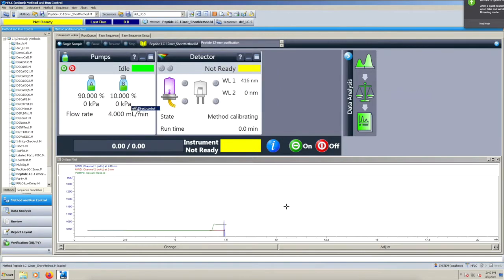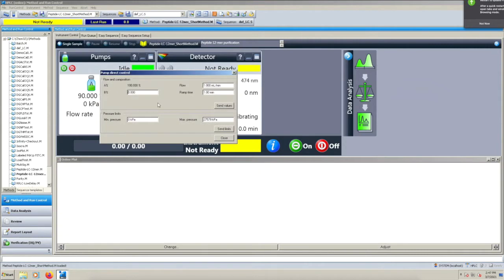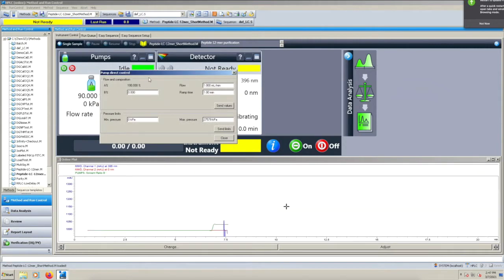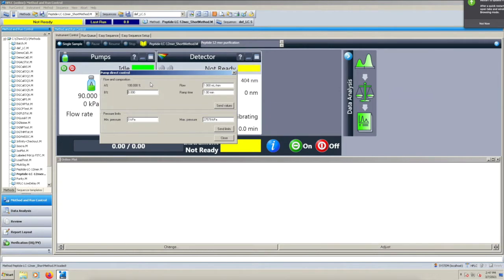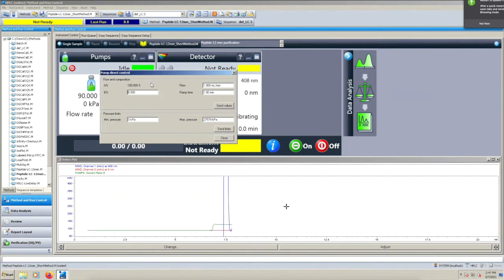The flow may increase significantly at this point, so right click anywhere in the pump window and select direct control. Bring the flow up to 80% B, which is acetonitrile again, at 4 mls per minute over a 0.5 minute time frame and click send values, which will send the values to the pump.